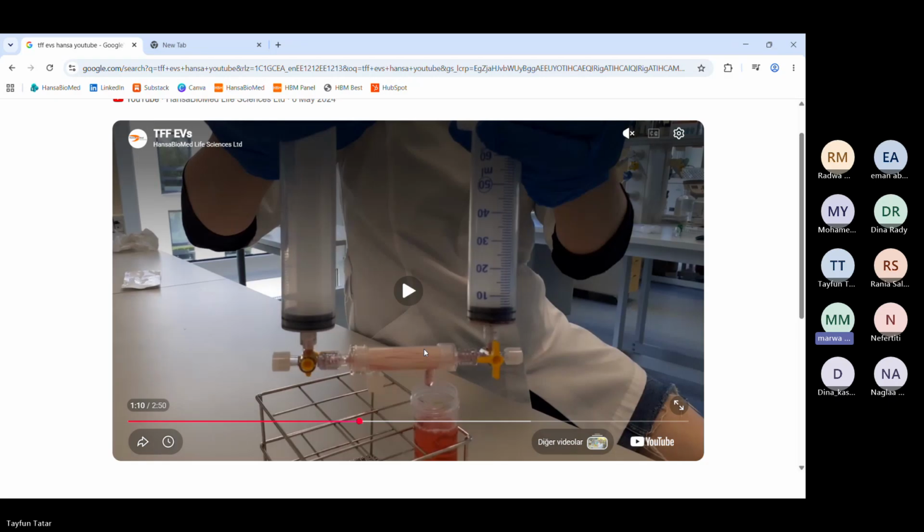Okay, what's the usual dose from 100 ml actually? Of course, it changes a lot on the biological source and condition, but in general, we obtain from 100 ml, let's say, 30 to 40 vials of our products, and each of our products has 10 to the power 11 particles per ml concentration. So you can maybe have an idea about the yield this way.